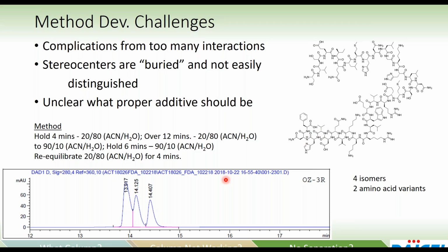So it's able to interact and get within those pockets, those chiral grooves that I showed before. Whereas there's coelution here of the amino acid variant that's buried within this chain. There's just simply too much other stuff going on to allow for that moiety to fit within that chiral groove, and so it's not going to show any sort of chiral separation.